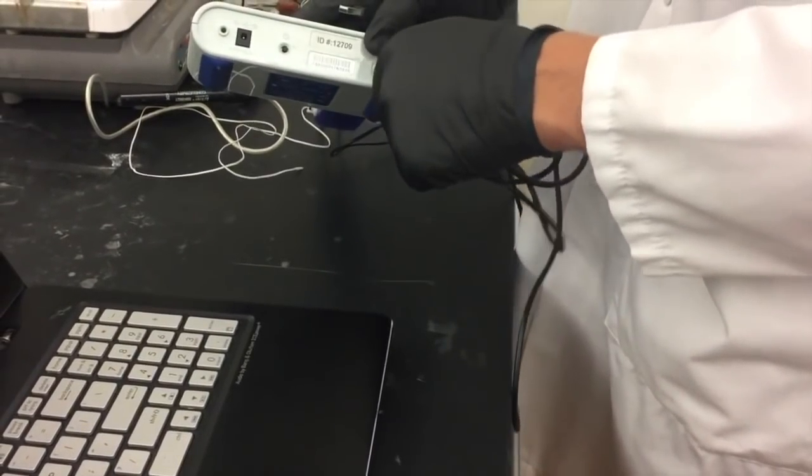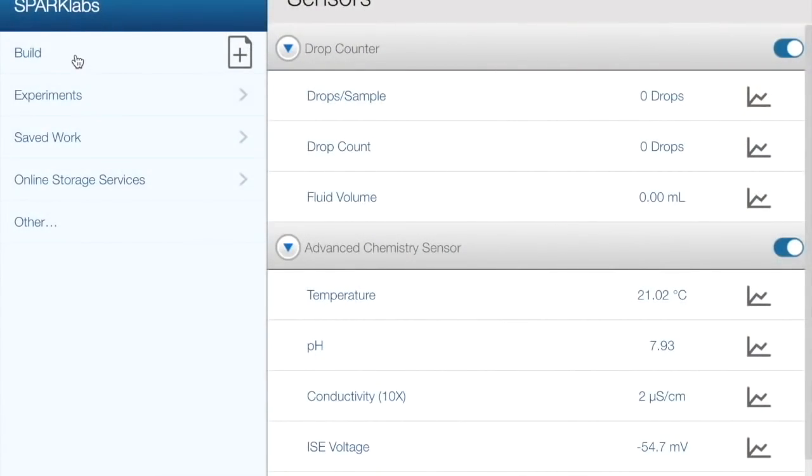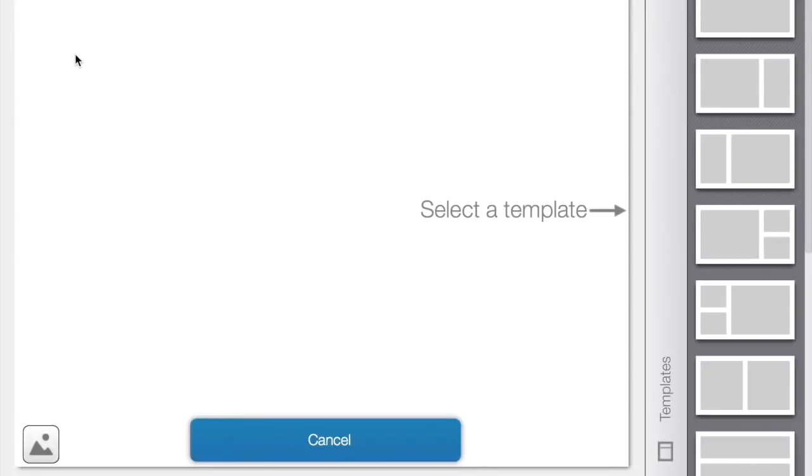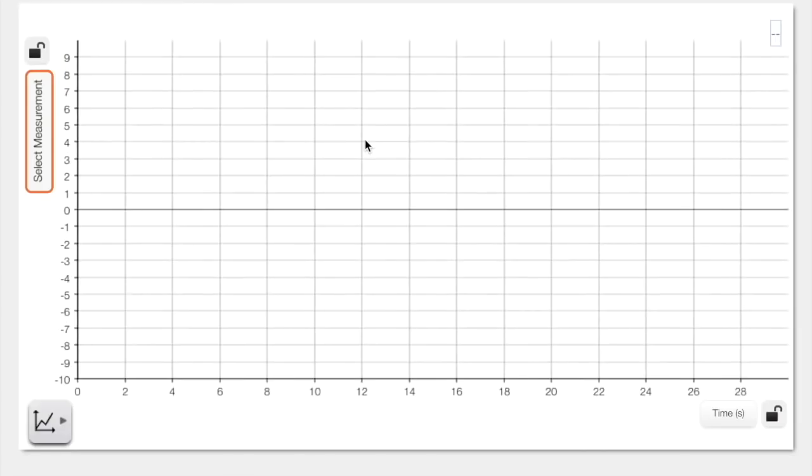The probes and meters are all set up now and you're ready to connect the SparkLink Air unit to your computer or tablet. Open the SparkView program and then select Build from the top left corner. Then choose the first template and select the first option in the top left corner in the pop-up box.